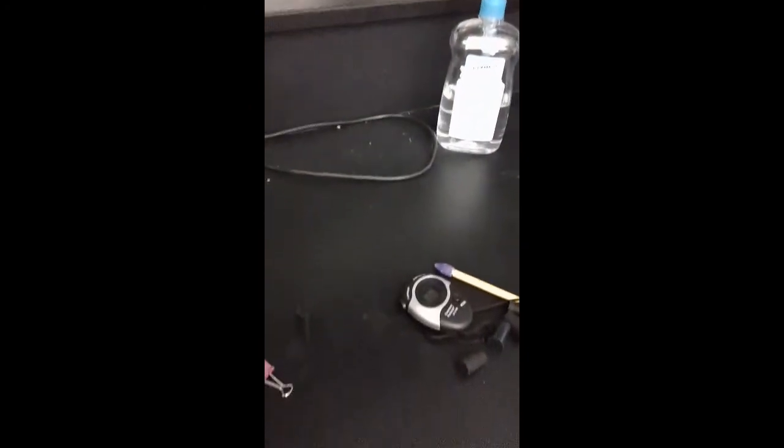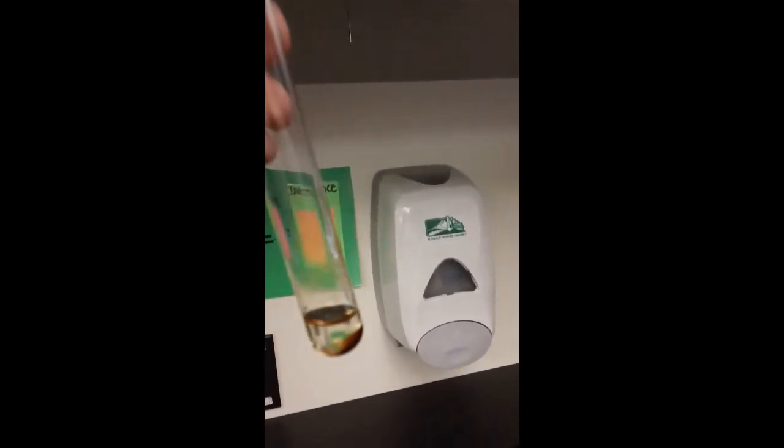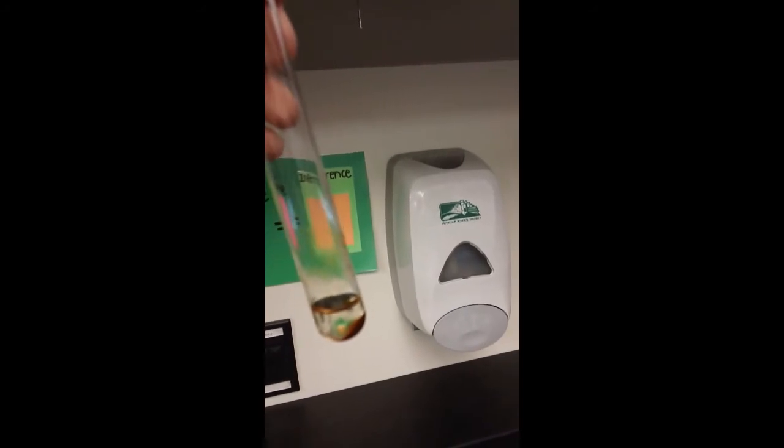Okay. Now we're going to have our Fe. So here, looks like we do have a solid. Note the color and how much. Make sure to note the solid and the liquid. Okay. Now we have the Zn. Notice that we do have a solid. I'm going to put it against the black countertop so you can kind of see it better. Notice the precipitate or the solid at the bottom. Note the color and the amount.